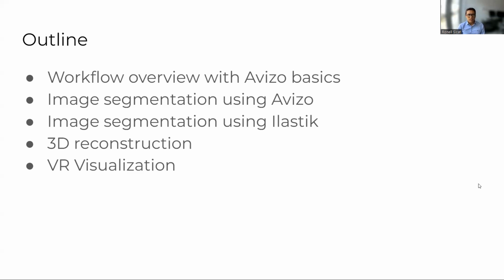And then we're going to dive deeper into image segmentation. First, we're going to use Avizo, and then we're going to use an alternative application called Ilastik. And then we're going to go to 3D reconstruction, and finally, VR visualization.